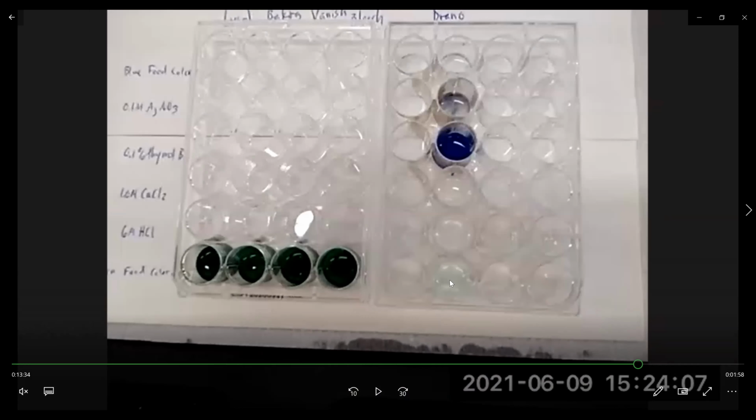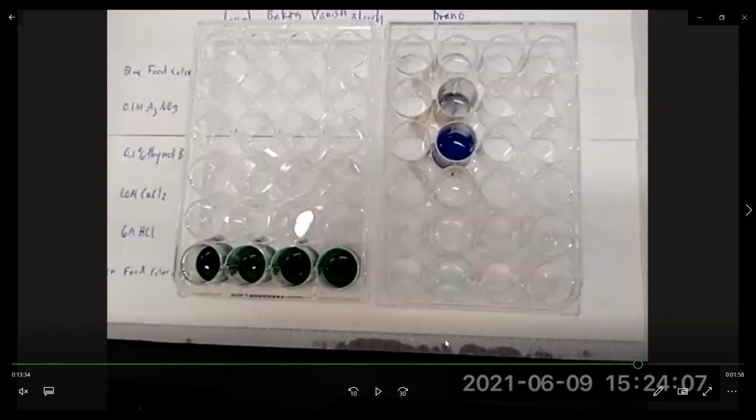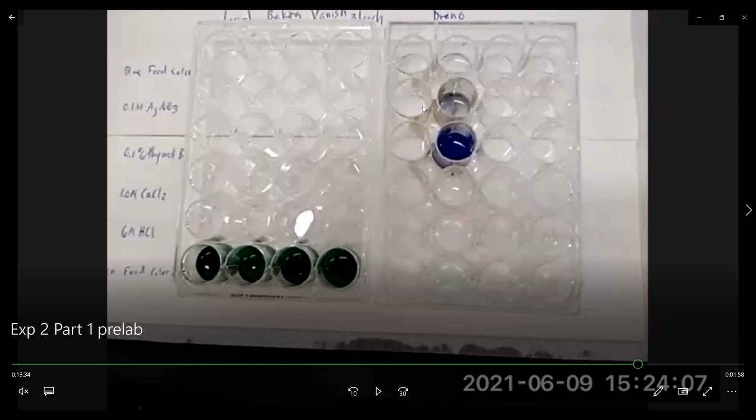So this is how we complete part 1 of experiment 2. Use cell well plates. You're going to have a list of reagents and a list of household chemicals, and you're going to see how the household chemicals react with the different reagents. Also, make sure that when you're mixing the HCl with the Clorox bleach, this is done in the hood. Now we're going to look at part 2 of experiment 2.